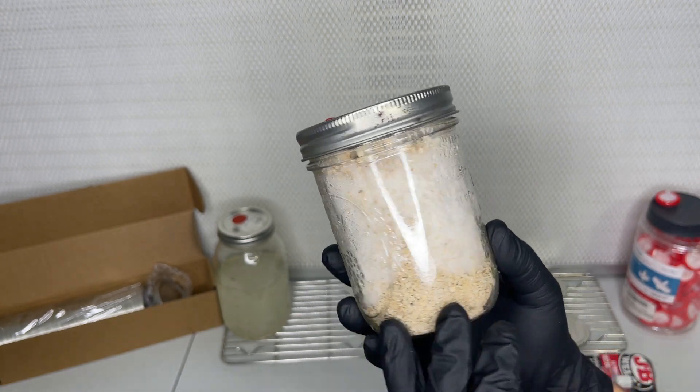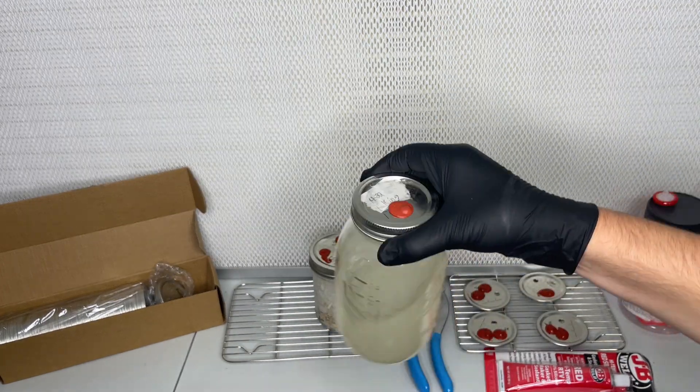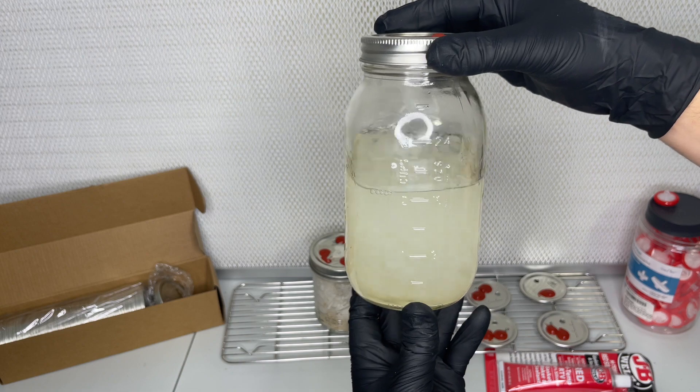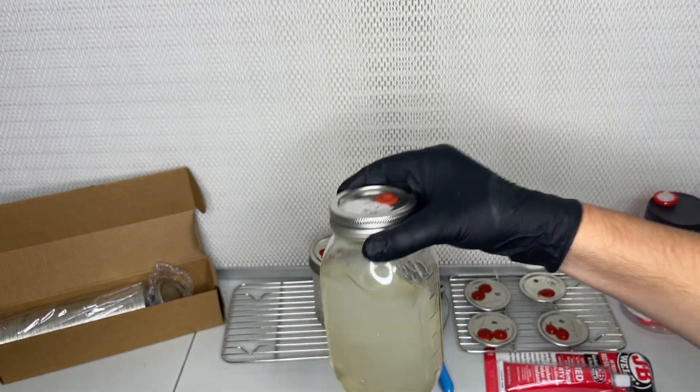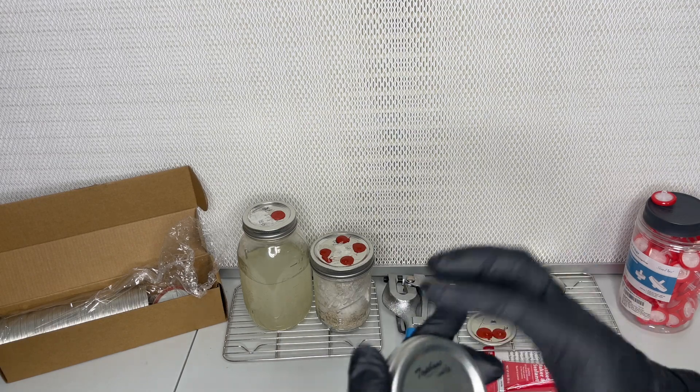I've always just used micropore tape for my liquid culture jars, but you just have to be careful that the liquid doesn't splash up and hit the filter. And these are the metal jar lids that I use.